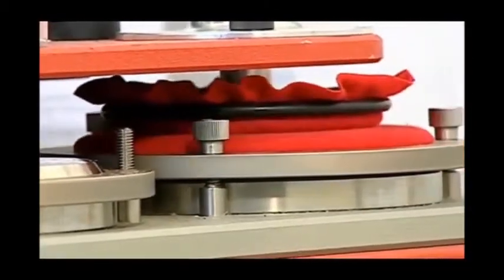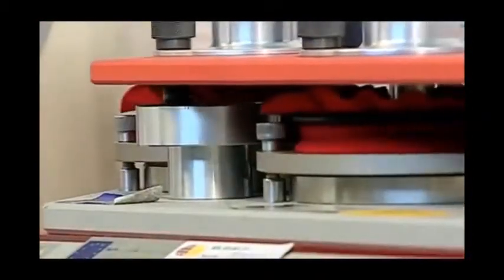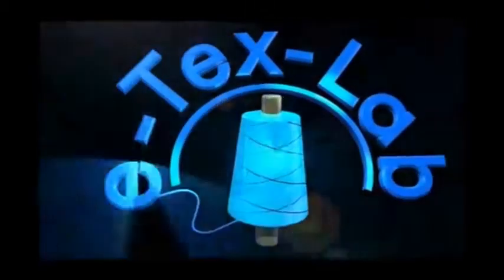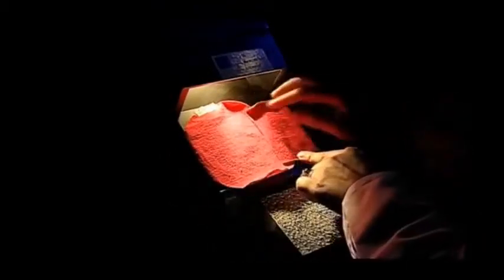At the end of the test, the sample is removed from the sample holder and is evaluated with the Fliskop device. Placing the sample that we have tested in the Martindale pilling evaluation on the front surface, we put the original sample beside it and compare it with the standard photographs whose degree of pilling is between 1 and 5. 1 is the worst result, while 5 is the best. Separate images are used for ratings.